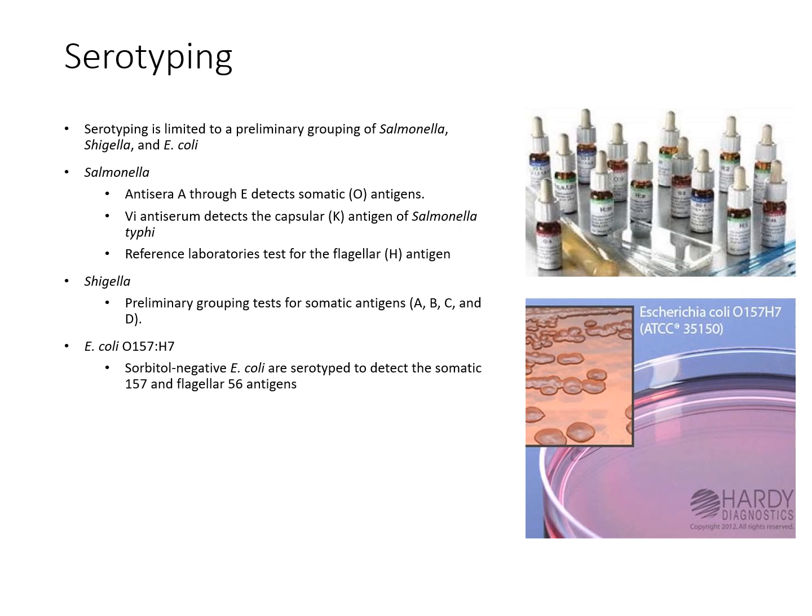Your Shigella, again, you're looking for some of the different somatic antigens. And then of course with your EHEC, your E. coli O157:H7, if it were to be suspect on your sorbitol agar, so it did give those colorless type colonies on the sorbitol, then you would want to do serotyping on that to confirm that that is what that organism is.